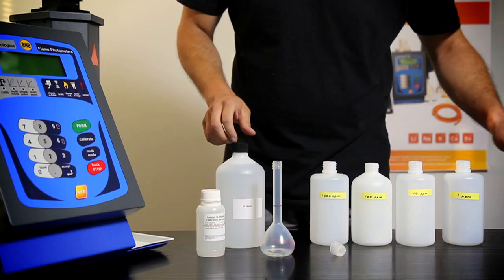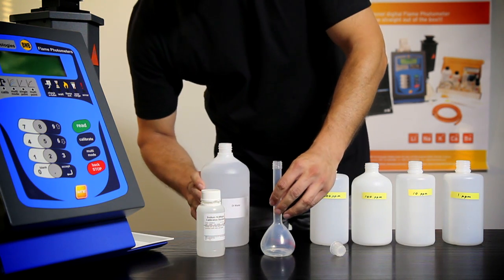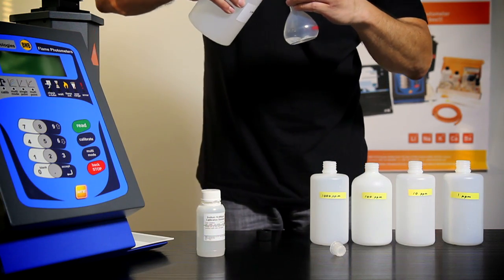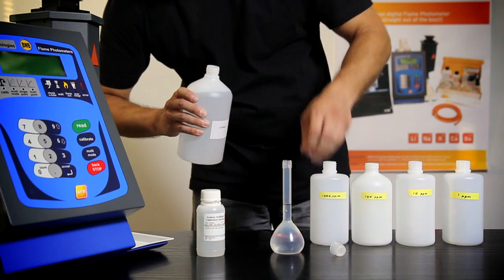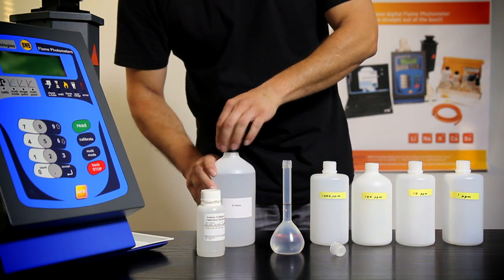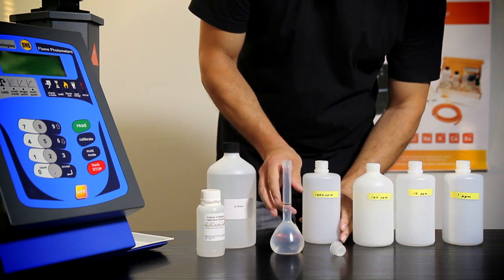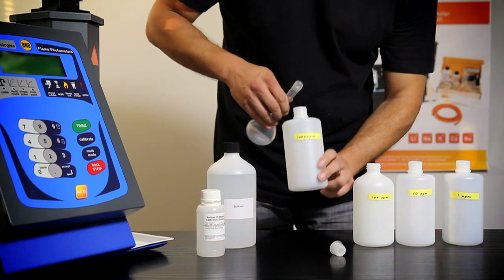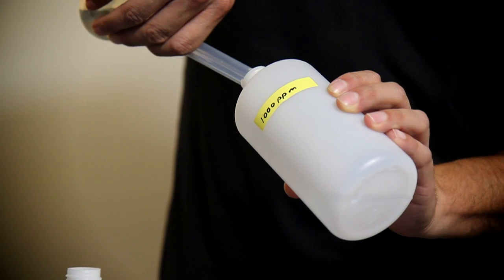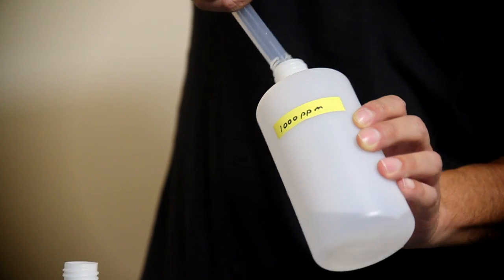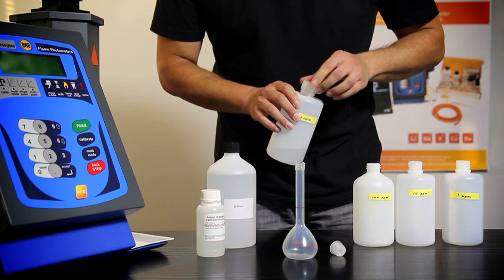Add deionized water to the flask up to the mark. Pour the flask contents into one of the beakers and stir well. This is now the 1,000 ppm standard.